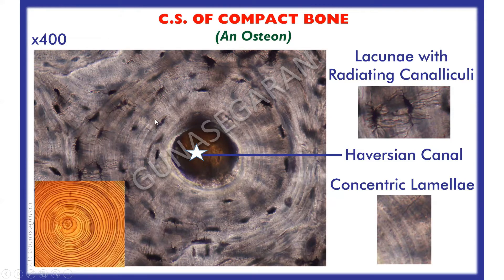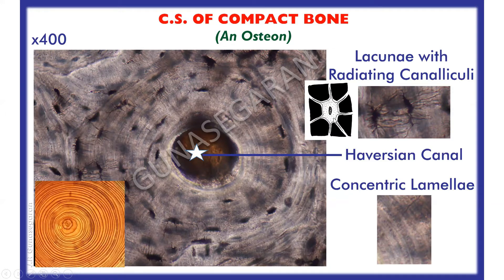Between the lamellae are elliptical lacunae with radiating canaliculi. These lacunae and radiating canaliculi are normally filled with osteocytes. The lacuna contains the osteocytes and the canaliculi contain the cytoplasmic processes of the osteocytes. The canaliculi of one lacuna communicate with those of the neighboring lacuna, and also communicate with the Haversian system, forming a network of interconnecting canals and canaliculi.